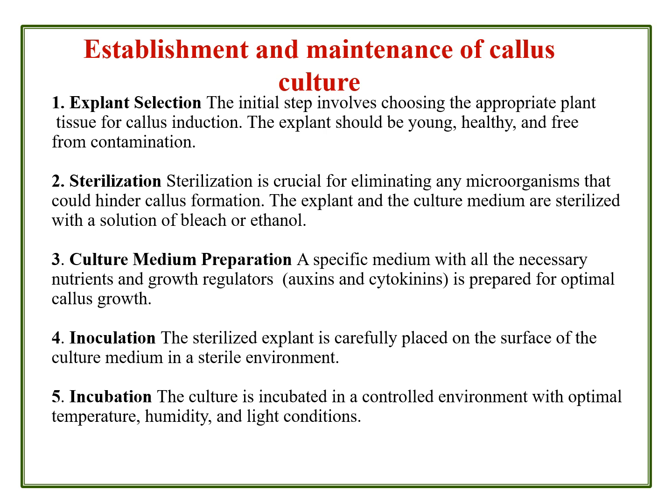So that sterilization is crucial for eliminating any microorganisms. Most of the microorganisms that may hinder the callus formation will be removed through sterilizing the medium. So the medium, whatever medium is designed for callus culture, should be free from contamination first of all. So the explant and the culture medium are sterilized with a solution of bleach or ethanol.